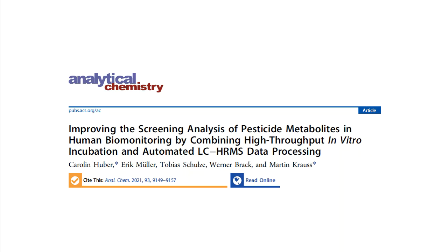In this video, I will analyze the fragmentation data of one metabolite of the herbicide atrazine, MassBank HB002826. Huber et al. had already determined that this metabolite, which they called atrazine desimin, had the molecular formula C8H13ClN4O2. Our objective here is to determine a tentative structure for this derivative of atrazine.